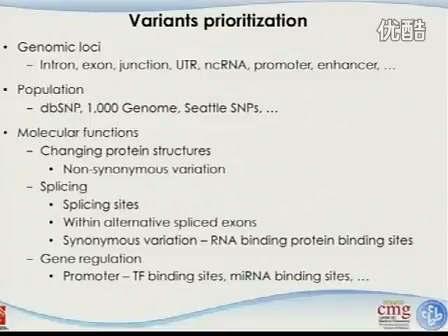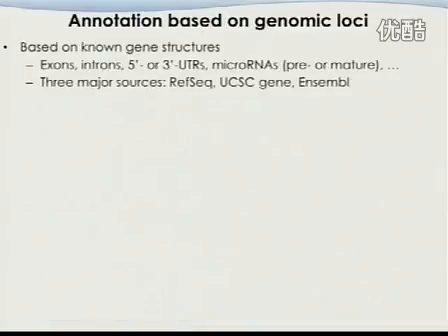These are things that you will not necessarily have covered by exon sequencing, but for some other type of sequencing project, like targeted sequencing or whole genome sequencing, that would be very valuable. For projects with targeted sequencing, not necessarily exon sequencing, this will be very important as well.